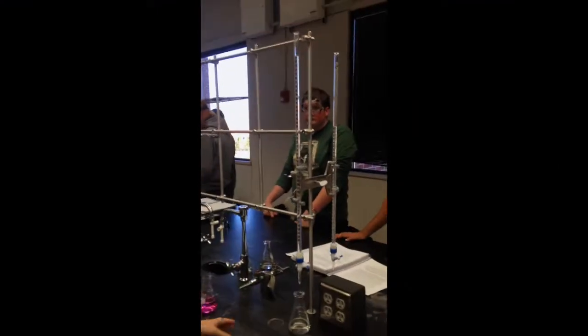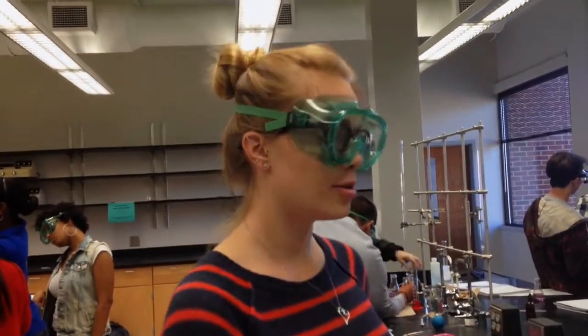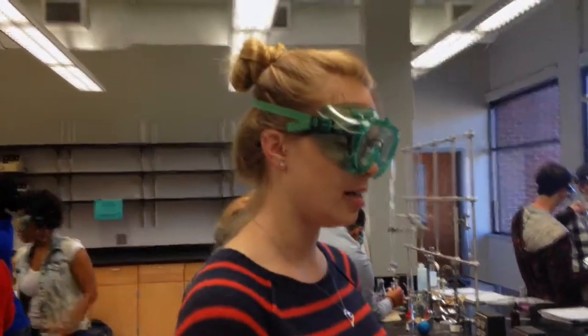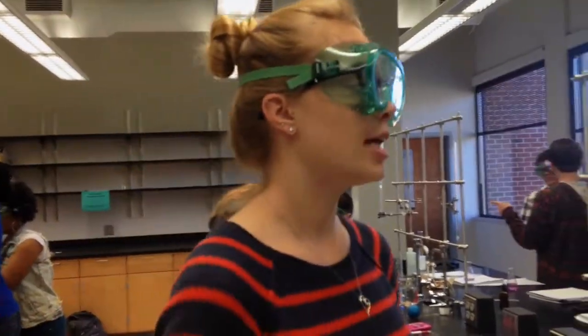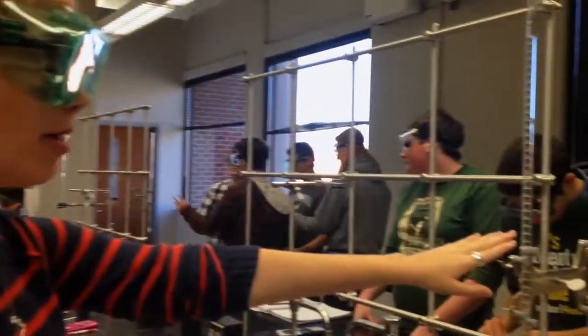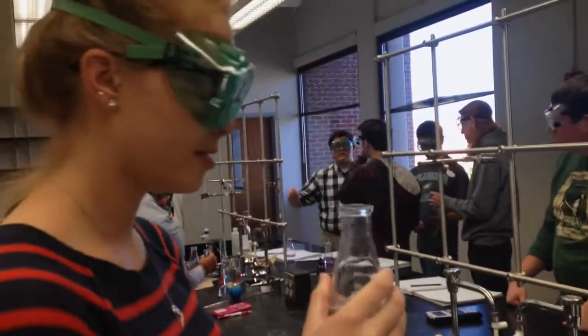So here we have NaOH, and we know the concentration of the NaOH. And here we have KHP dissolved in water, and we added an indicator. The indicator will change color when the equivalence point has been reached, which means when it's been fully titrated. That's when we'll know what the concentration is. And we'll use the milliliters of NaOH to determine the concentration of this.